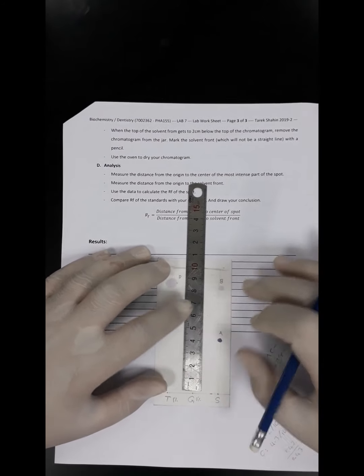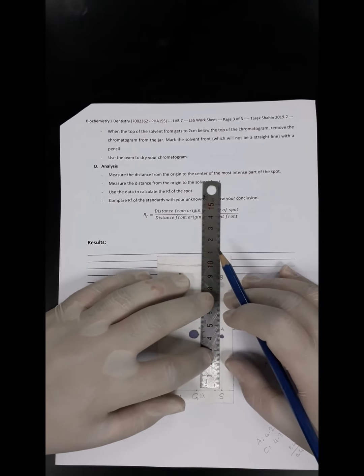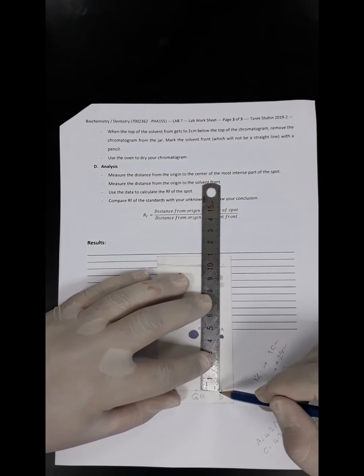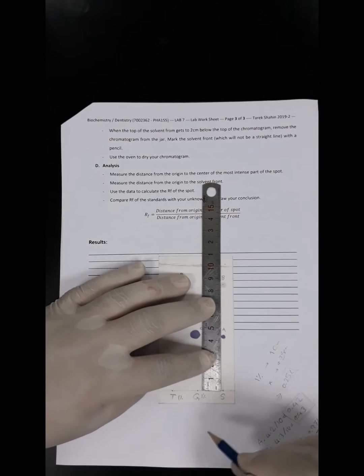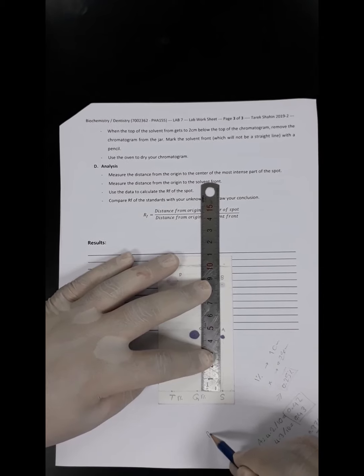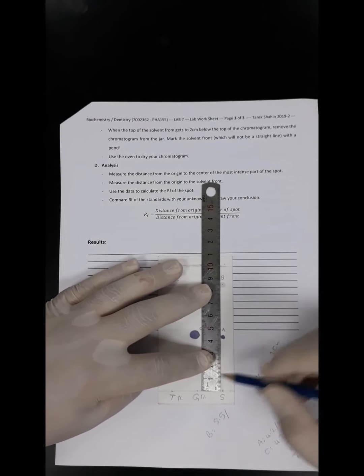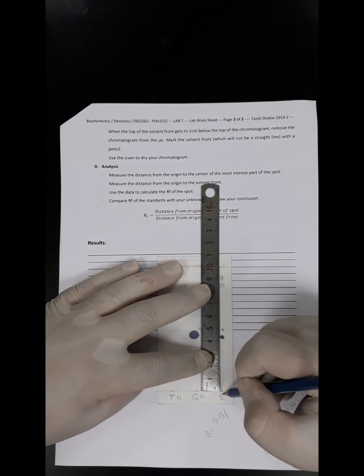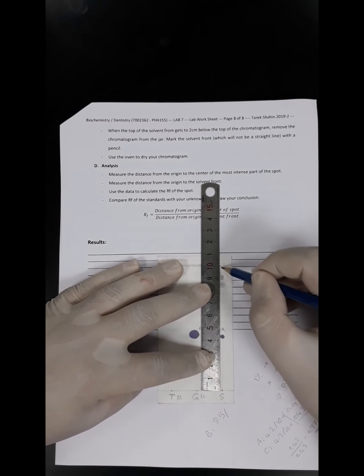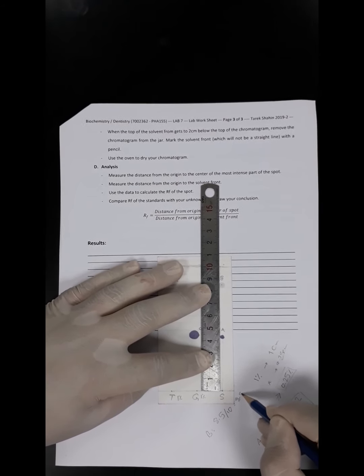Now we are going to do the same with spot B and spot D. For spot B, the distance traveled from here to there is 8.5. And the total distance from the baseline to the solvent front is 10 centimeters. So it would be 8.5.